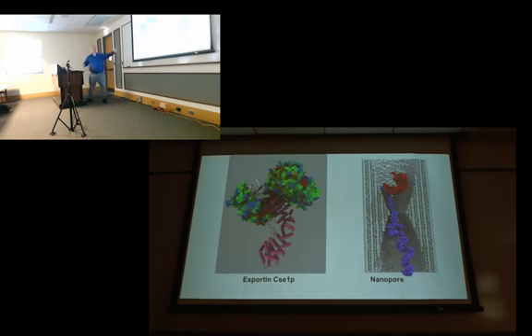If you chose a black background, then the bright colors would really stand out, and the dark area here would not pop as much as it does here. Here you have a nice contrast, and it highlights, like if this had a black background, you wouldn't see this part nearly as well, right? So this is another thing.